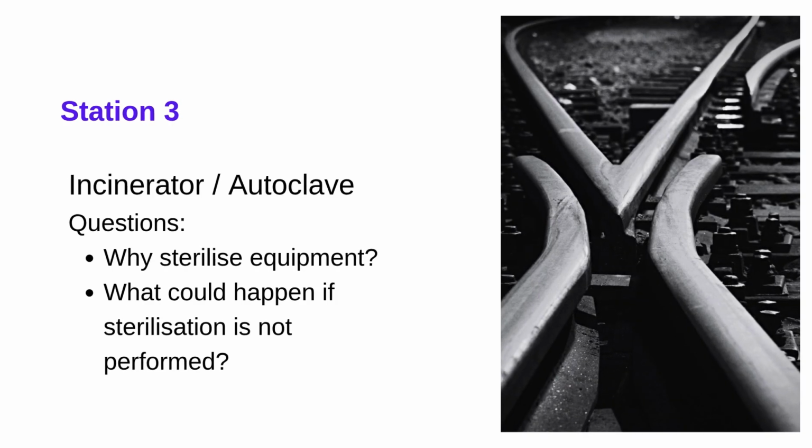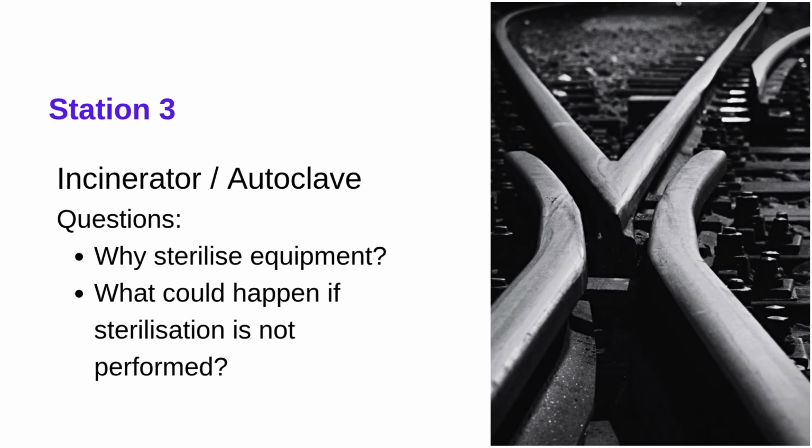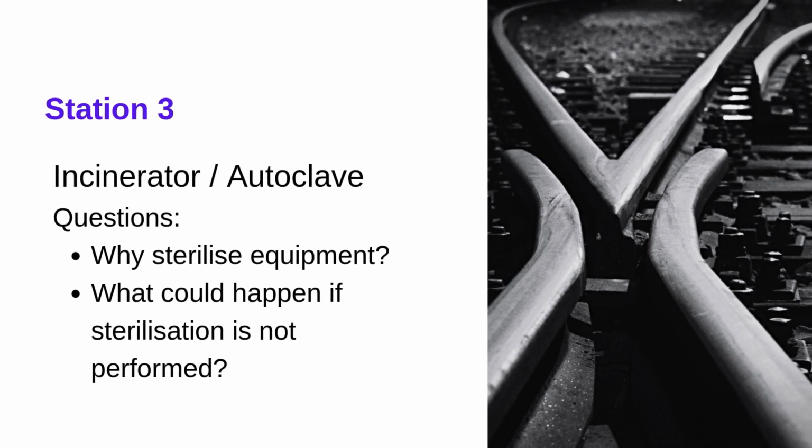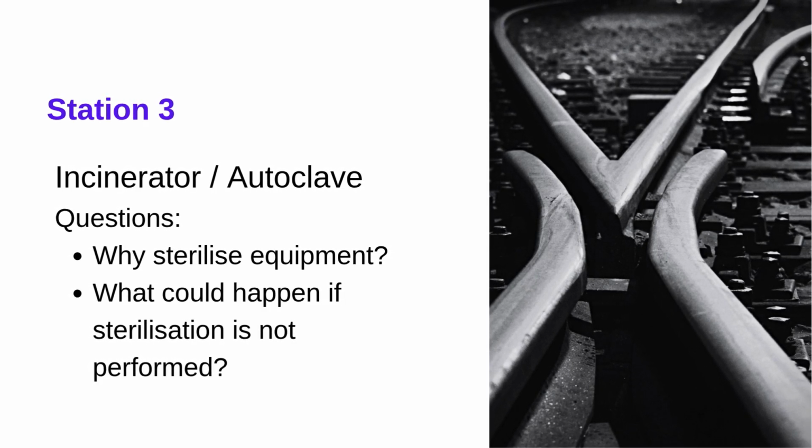At Station 3, investigate the role of the incinerator and autoclave in microbiology laboratories. Discuss why equipment must be sterilized before use and consider the consequences of poor sterilization, including contamination, inaccurate results, and potential risks to health and safety.